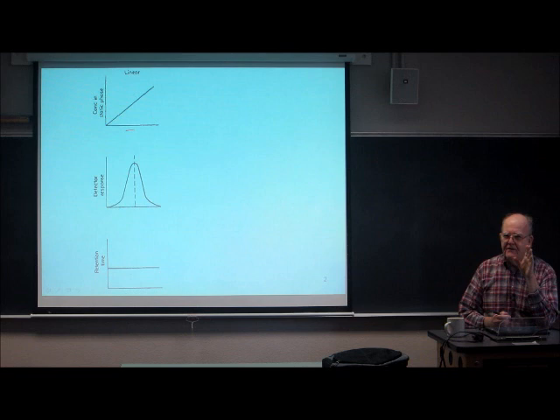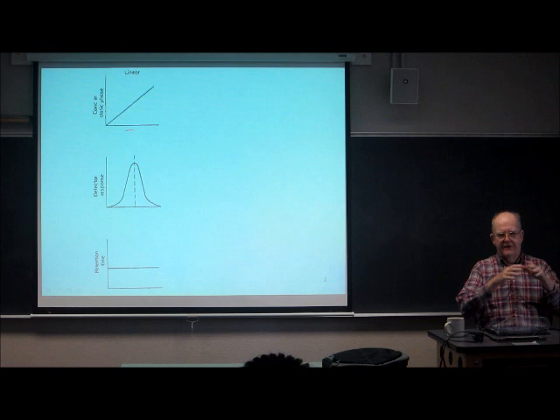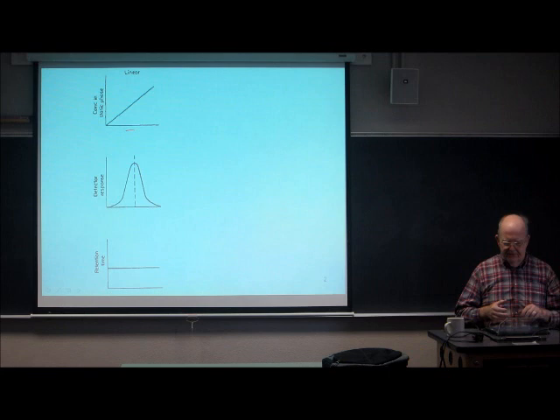So we're not convolving together two different processes. There's the process of volume overload when you inject an excess of volume into a small column. We're talking about mass overload, when there's no more room left in the stationary phase for the solute to behave in a linear region.